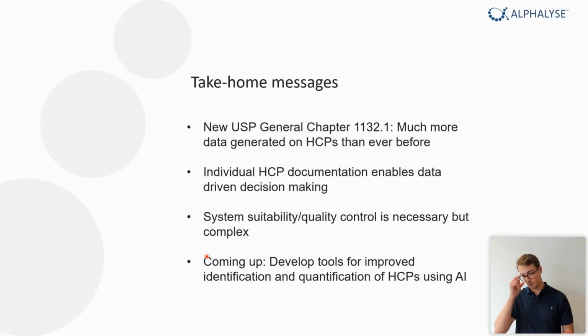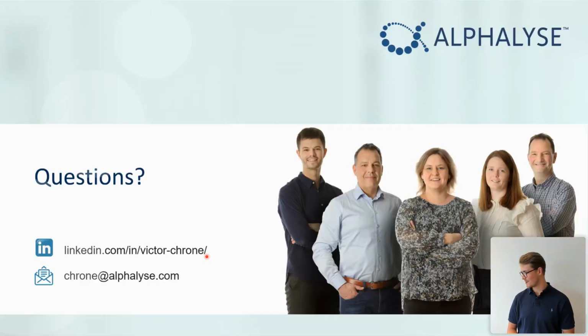And then something which is coming up: development of tools for improved identification and quantification of host cell proteins using machine learning. This is something which I really think all of this data will enable. It will take a lot of time, but it will vastly improve this analysis if used correctly. And I think that's it for me.